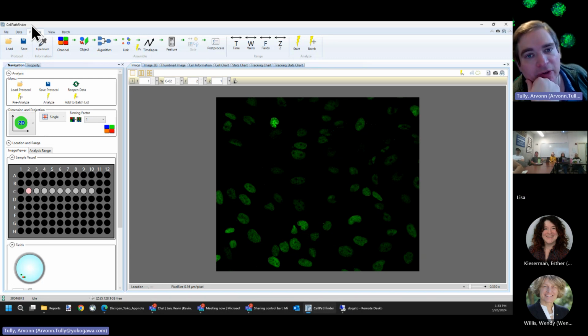All the academics write their own, and it works for their data, and then sometimes it works for other people. A lot of people like ImageJ. ImageJ is the most flexible software. It has the most plugins. ImageJ can do everything, and as a result of doing everything, it makes it really hard to do some things, and training people how to use it is a real challenge.